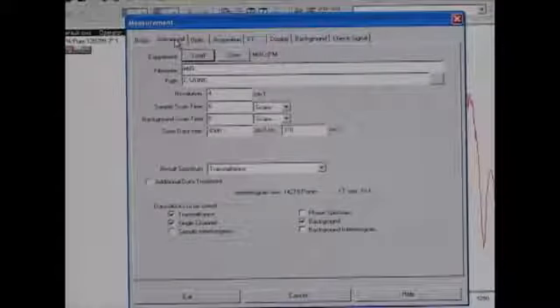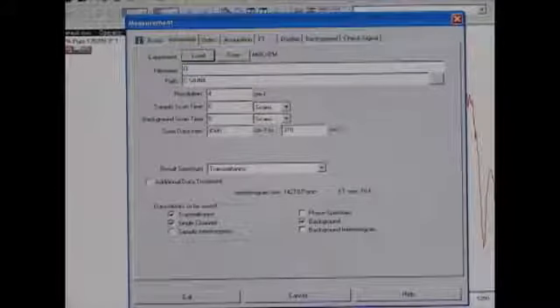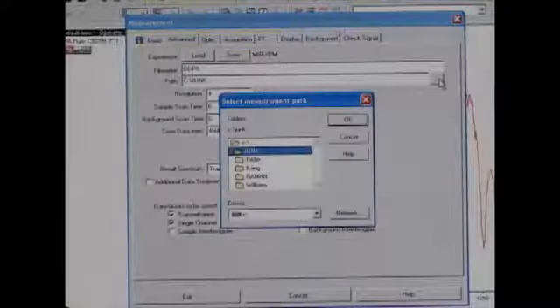We're going to make sure that the experiment is MIR.AXPM. We're going to enter the operator's name and the sample name, in this case, octadecyl phosphonic acid. And after that, we're going to click on Advance. So we already went through the experiment, which is already loaded. We went to the file name, which is the name that you want your sample to be called. So I will put ODPA, and then the path that you would like to select.